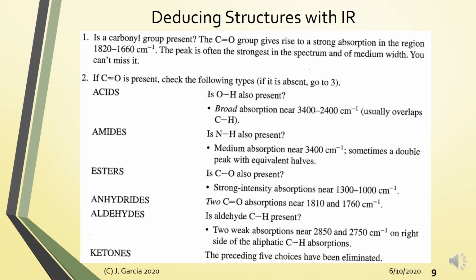Okay, so again, alam natin na IR is useful for generating a chemical fingerprint, okay, for a particular sample. So if you have a standard ng product mo na paint, you run the IR, so you get the spectra. Then yung product na nasa market na sasabihin natin counterfeit, you run yung IR ulit. Okay, if the IR spectra for the sample is different from your standard, then we say na you have a counterfeit product, no, evidence yun. Kasi chemical fingerprint mga IR.